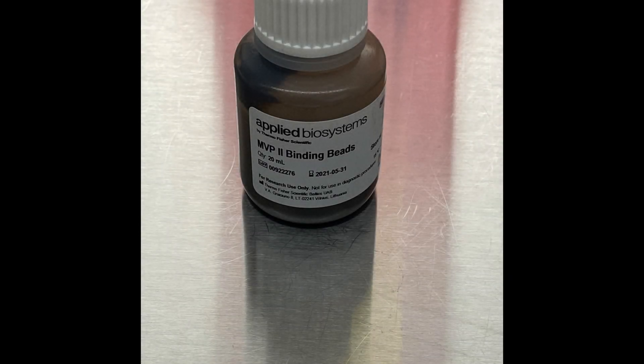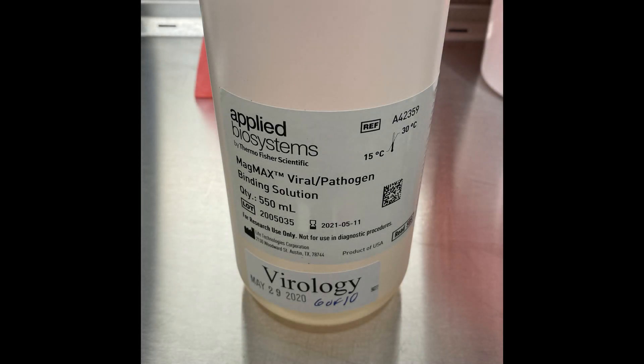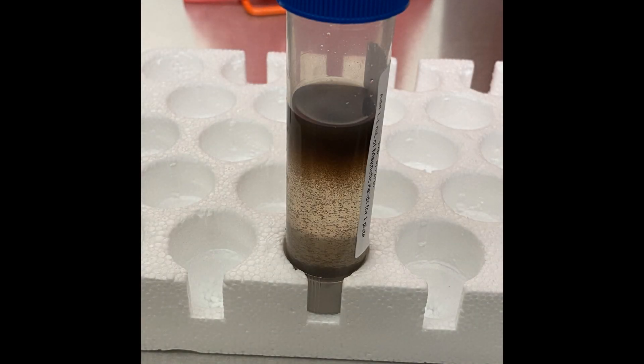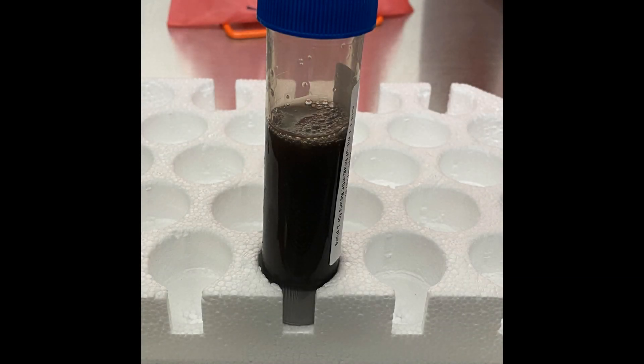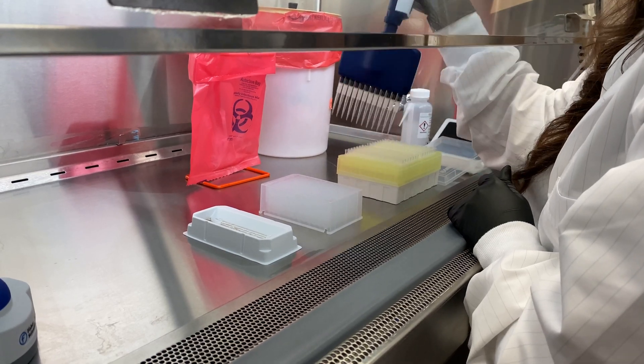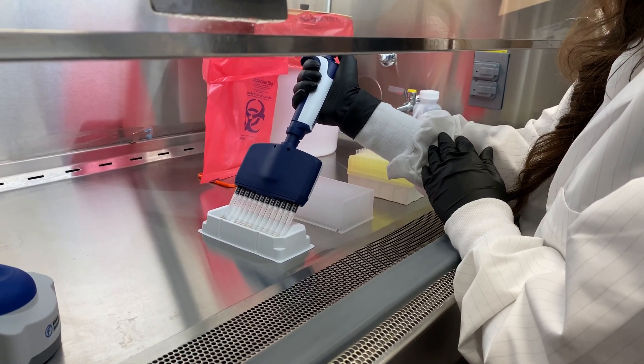After the patient samples, 275 microliters of binding bead mix is added. The mix is a combination of 1,100 microliters of MVP2 binding beads and 29.15 mils of MagMax viral pathogen binding solution. Note that when the beads are added to the binding solution, they separate. Gently mix the solution by inversion to generate a homogeneous solution. Avoid making bubbles as much as possible. The binding bead mix is very viscous, so pipette slowly to avoid air pockets in the pipette tips.